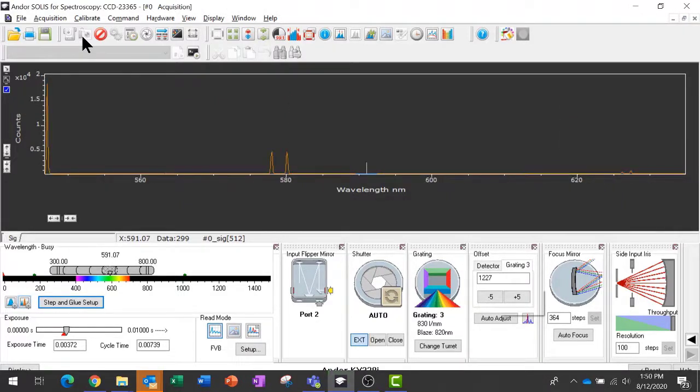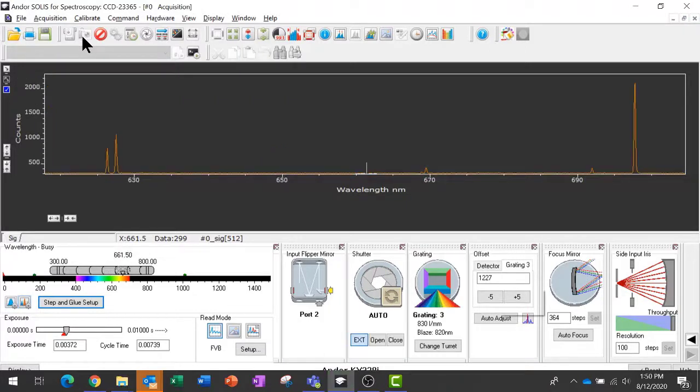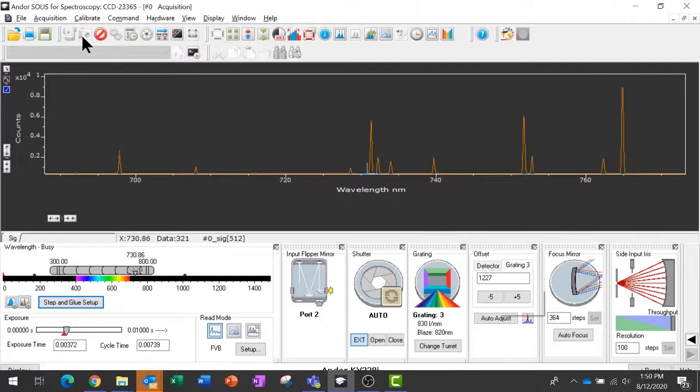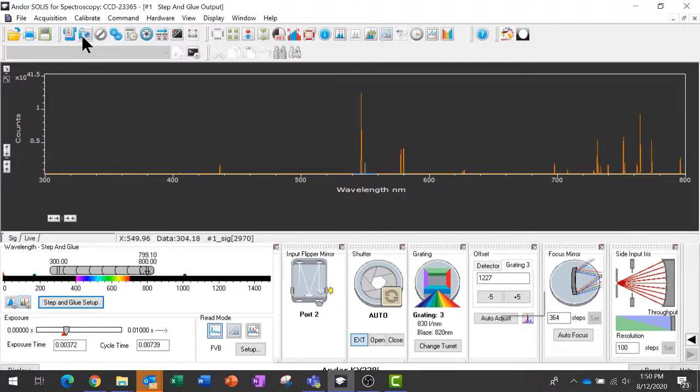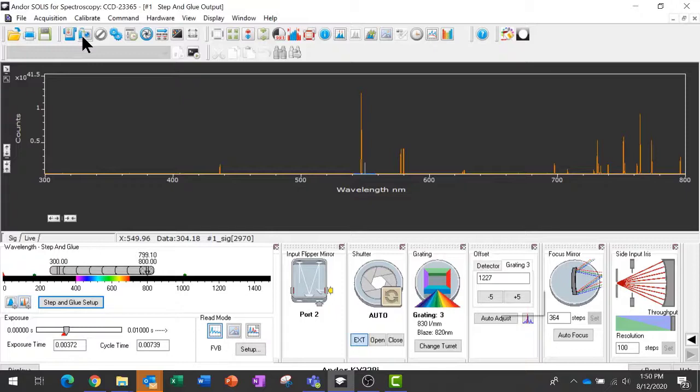So now if I take data, the software will automatically go to the first position, record a measurement, next position, record a measurement, and automate measurements over the entire range with the appropriate overlap. And we can go through and optimize and change those settings depending on our particular needs. But at the end of that measurement series, what we'll get is a very wide, wide band measurement, but with the resolution of our higher rule grating. And this has a lot of uses in many different applications.